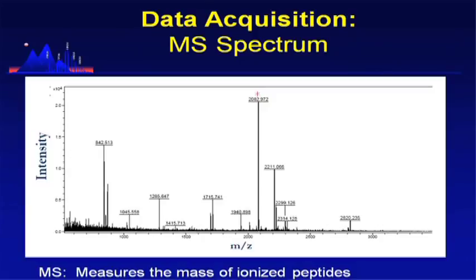That's right. So this is what a spectrum looks like that you get out of a time-of-flight mass spectrometer. The x-axis in your mass spectrum is always m over z, or mass over charge. And the y-axis is always intensity. These units here are very arbitrary.